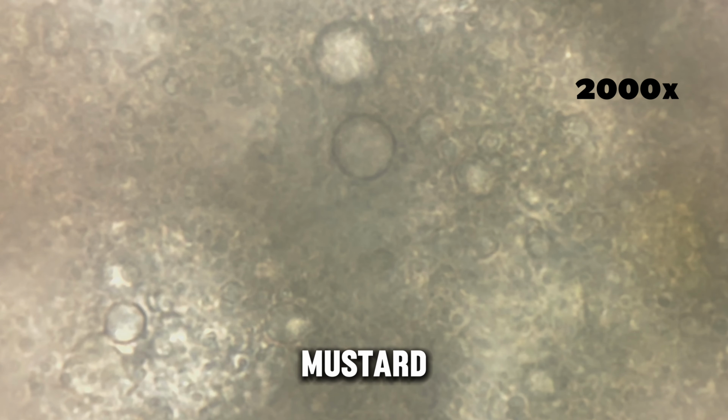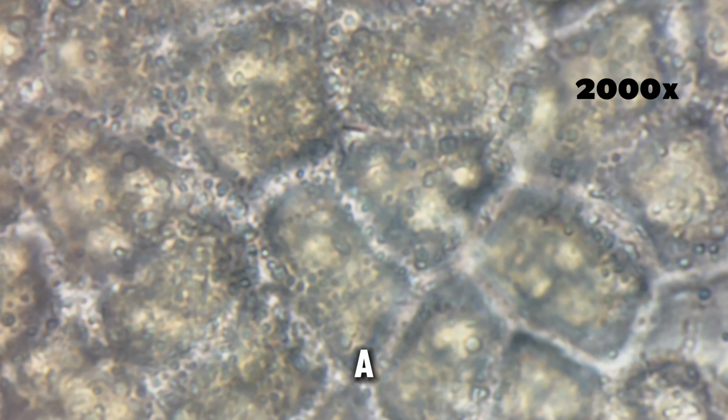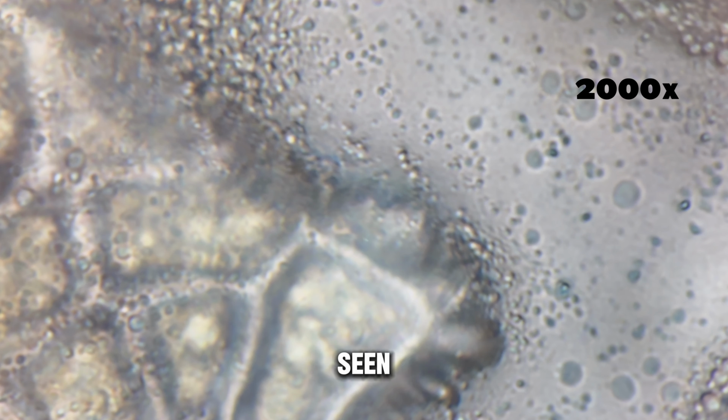At this level, mustard looks less like food and more like a microscopic system. A system formed from seeds, liquid, processing, and chemistry. This hidden world exists inside something people use every day, yet it is never seen. Looking this closely changes how familiar food feels.